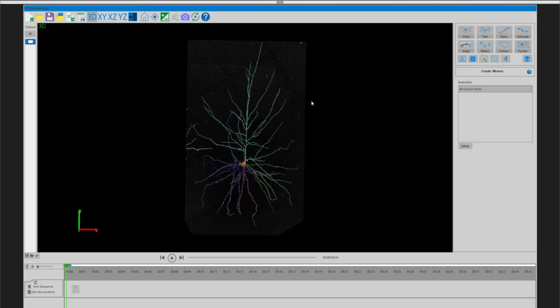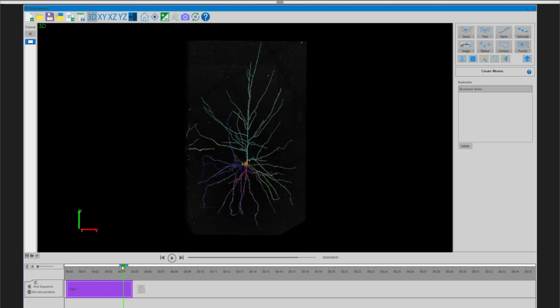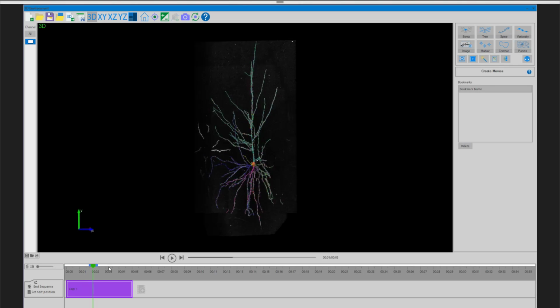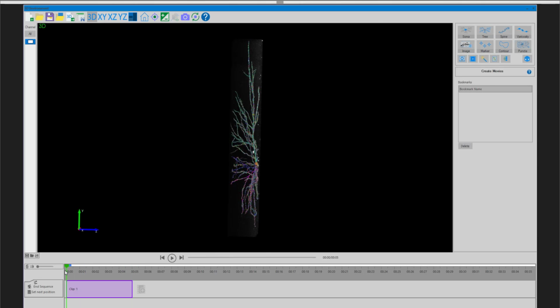but this is the next position that I want captured. So when I go down here, I can either hit set next position or click this icon to create a new clip. When I do that, it's going to generate a movement for us. As I move my mouse along here, we can see that the program is going to automatically move from the starting position to the ending position, and it's going to know the fastest and most smooth way to transition from point A to point B.